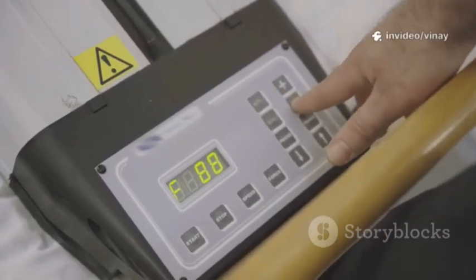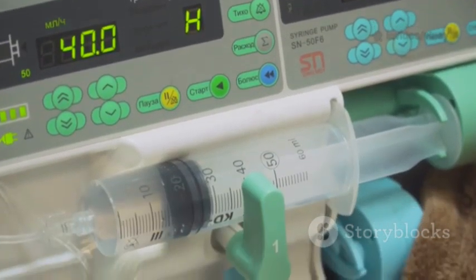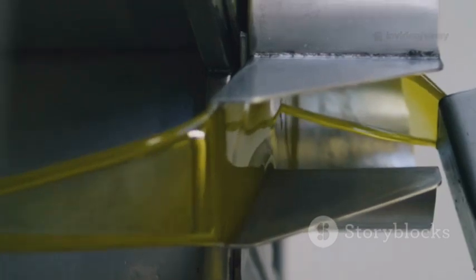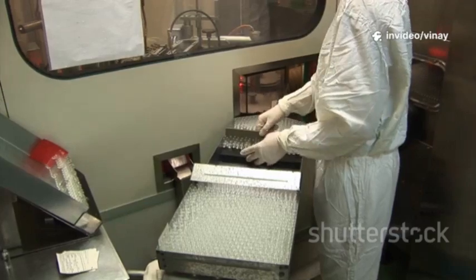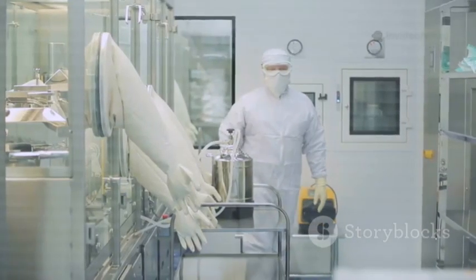If the measured flow rate is higher than the manufacturer's limit, let's say 40 milliliters per minute, it indicates a problem. This high flow rate means that gas is moving through the filter much faster than it should by diffusion alone. This is a strong sign that there is a flaw, like a tear or an oversized pore. The gas is no longer just diffusing, it's actually flowing in bulk through a defect. This is called bulk flow, and it's exactly what we don't want to see. A failed forward flow test means the filter's integrity is compromised, and it cannot be trusted to produce a sterile product. This test is highly automated and gives a precise numerical result, making it a favorite in the pharmaceutical industry.